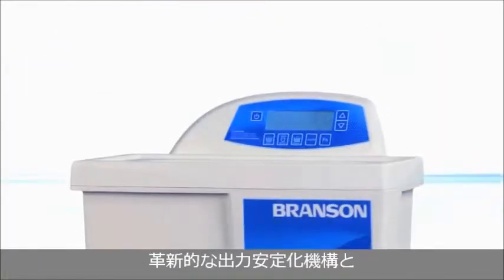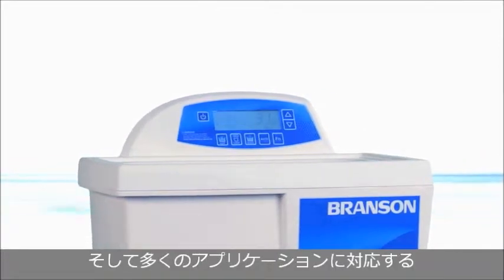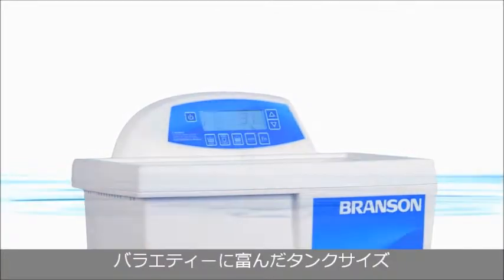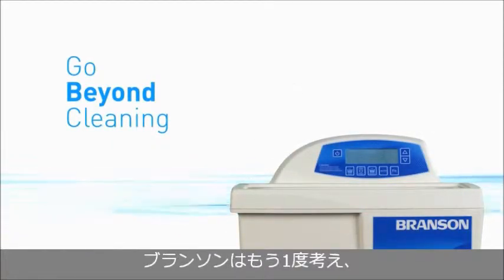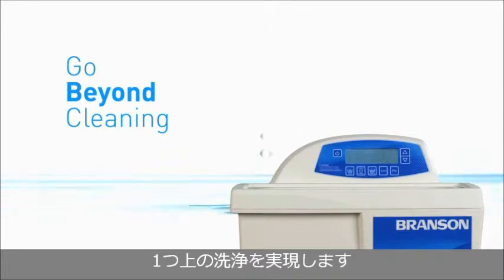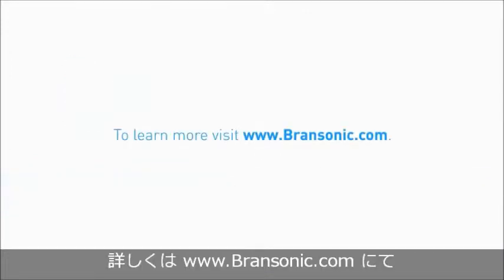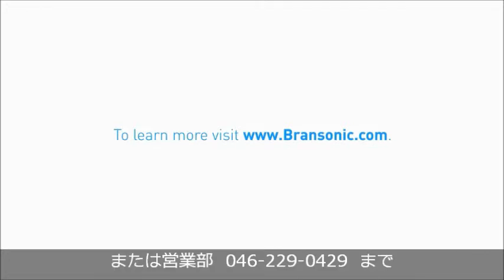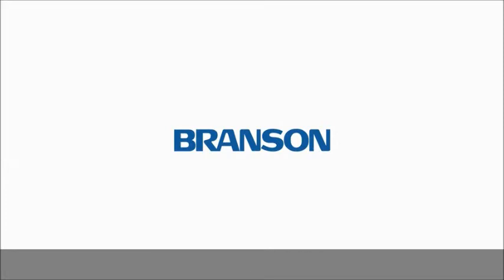From our innovative self-adaptive technology, to flexible programming, to a variety of sizes to accommodate a host of applications, we've reimagined what it means to clean with precision. Are you ready to go beyond cleaning? Visit bransonic.com or contact your dealer today to learn more about the new line of digital ultrasonic baths, as well as our complete line of baths.